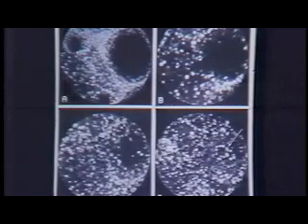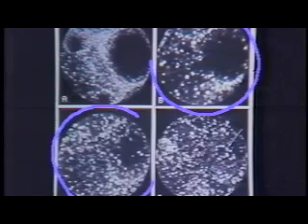Okay? That field ion image is because the radius of curvature is sharp. If we now apply CO and desorb it from the surface with a high voltage pulse, what you see is a CO plus image that looks sort of like the field ion microscope image. But now we can raise the field without changing the lattice because CO desorbs at a low enough field strength. We won't field evaporate. And that means we can see more of the CO from the center of the plane. And finally, if we go to a high enough field strength, we get CO from the whole surface, including the center of this plane, 3,000 angstroms across.